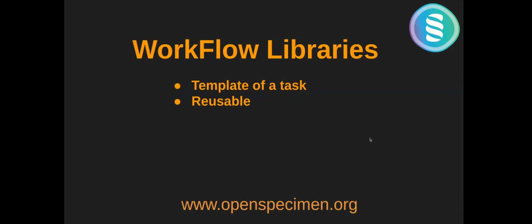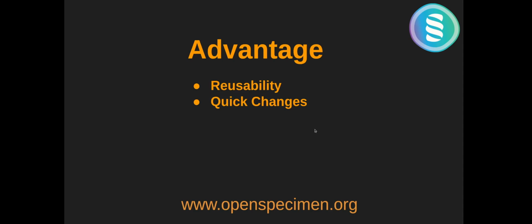So let's start. Workflow libraries are basically the template of a task. This template can be reused again and again in multiple workflows. Due to this reusability, you can connect your single workflow library task to multiple workflows at once, and any changes you make in your workflow library task will be reflected in all the workflows that it is connected to.